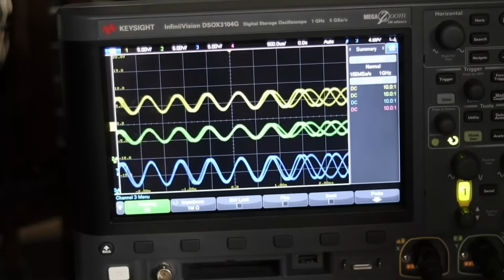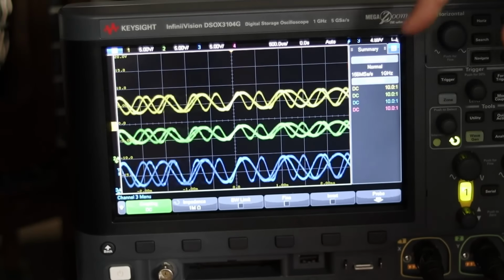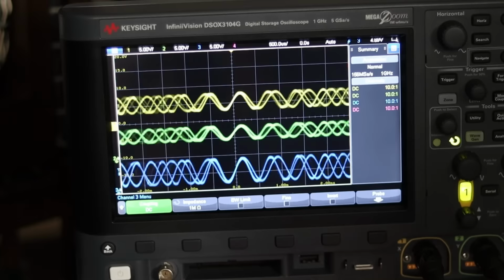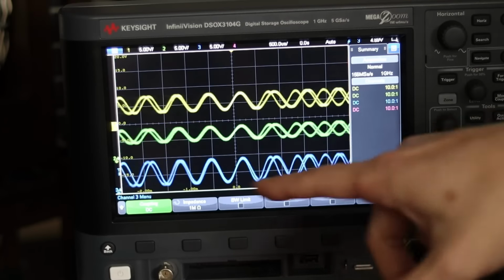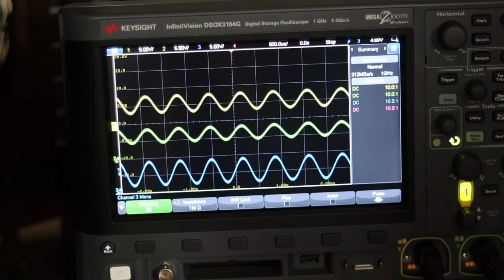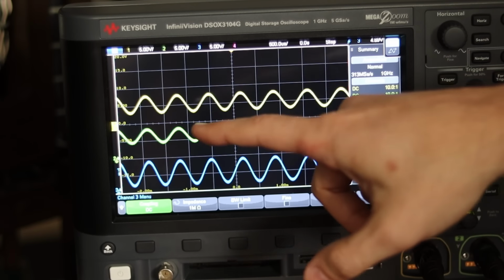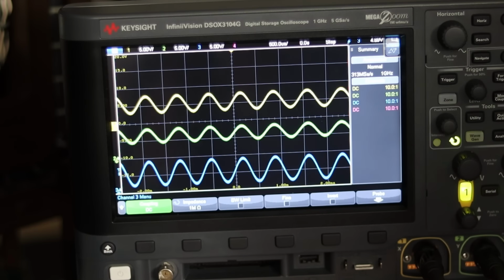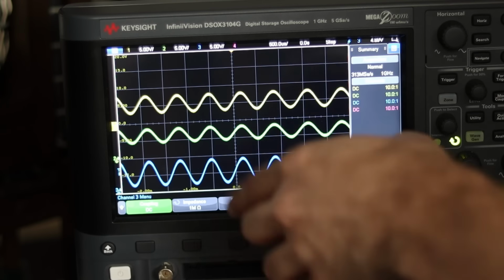All right, check this out. This is pretty cool here. There's a lot of jitter going on, and that's because our motor needs a little extra help. But look at this. The peaks, even the jitter, are all perfectly in sync. If I take a single shot here, you can see that the peaks and valleys line up perfectly. And this is X, Y, and R. So that means that the laser is striking those three sensors perfectly flat, which means we're aligned. That's what that means.